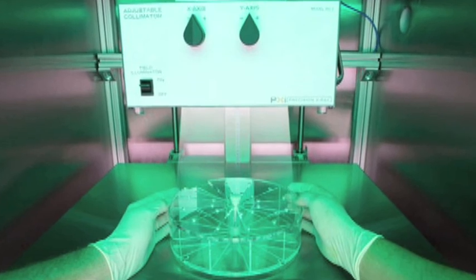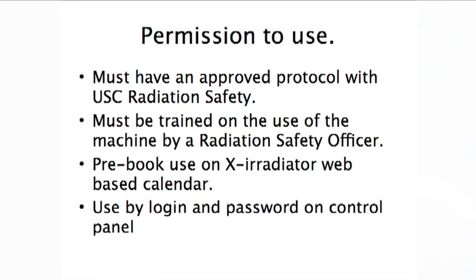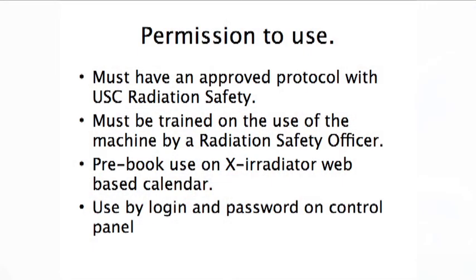This machine has some big advantages over the old irradiator. In particular, it's computer controlled. In order to use this machine you have to get permission, which is very similar to the previous permission protocol. You have to have an approved radiation safety protocol through regular channels, but we've added one more layer. We are also set up on the radiation safety website an X-ray irradiator calendar where you can book time on the machine so that people are not trying to use it at the same time.